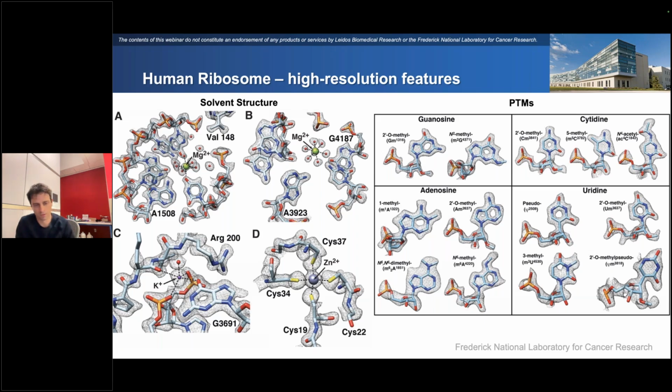For some of those it gets easier, but there are also challenges when you get to higher resolution as you see more things, as we talked about earlier with the hydrogens. Shown here as examples are magnesium and zinc. The zincs are trivial. The potassiums are ultra difficult, I think, distinguishing potassiums from waters, and there are some different ways to do that as far as how they coordinate waters. But of the ones shown here, the potassium is probably the most challenging.